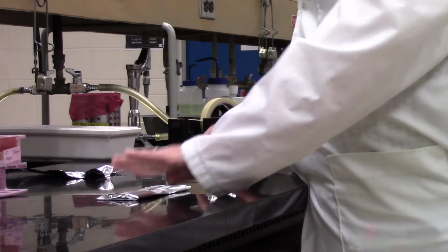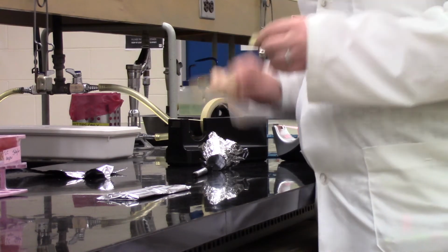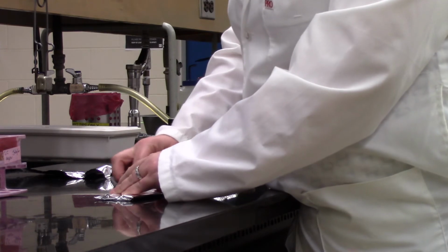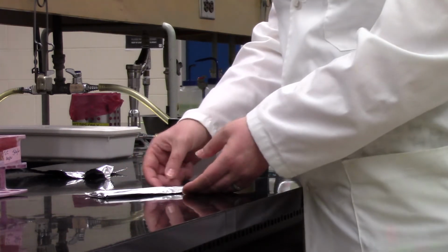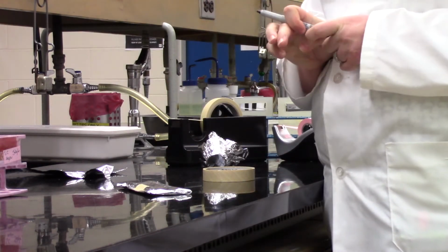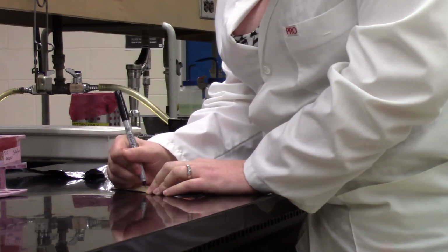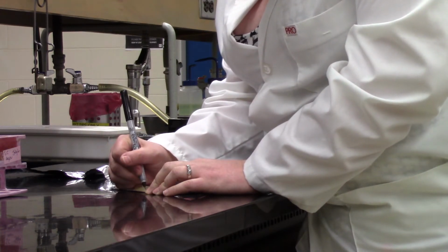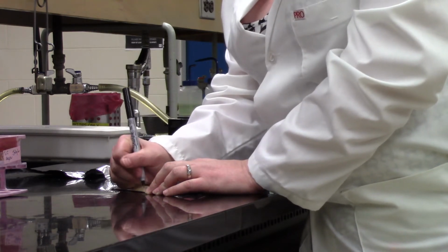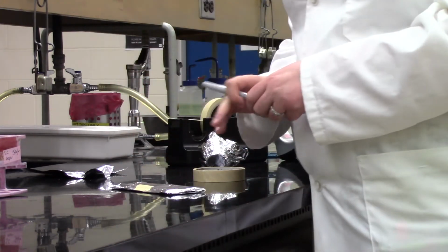And then I would give my little packet a small strip of autoclave tape. And for these, I can even save myself a step. Instead of using a piece of lab tape, I'm just going to write my label right onto the indicator tape. It's going to be very obvious that these are spatulas, so I'm just going to put my initials on this one so that I know that this is my sample that I prepared.